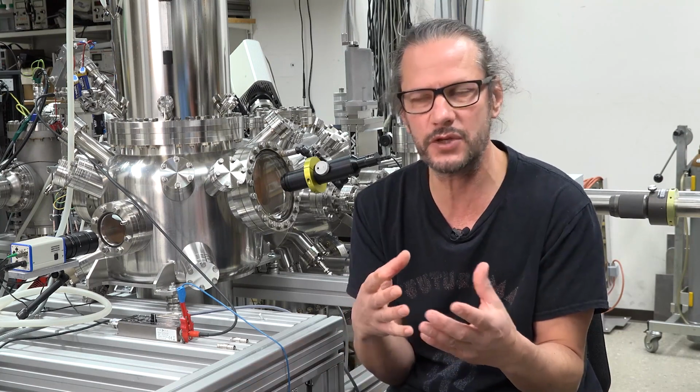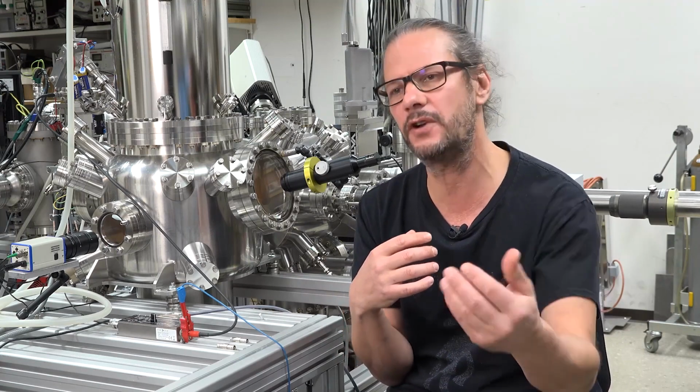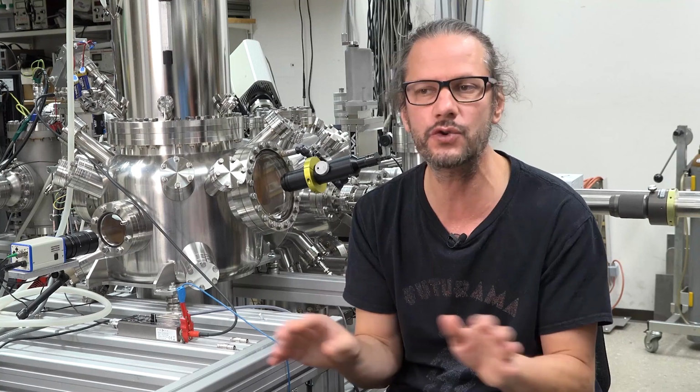And there are a few molecules that can only be resolved if we add AFM as a complementary tool to the existing tools. One important thing is that the aim is not to replace any of the tools. It just gives a different angle, mainly through its single molecule sensitivity, so it gives complementary information that can add to the other tools. But for sure it will not replace the other great tools that we have to study meteoroids and molecules in general.